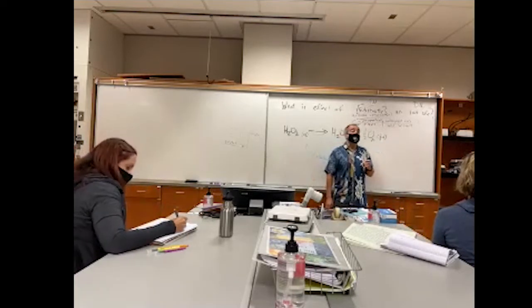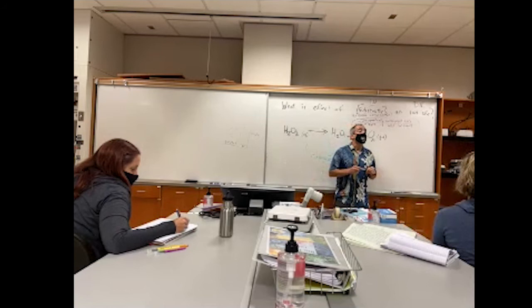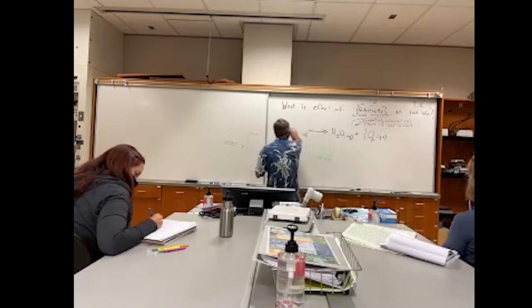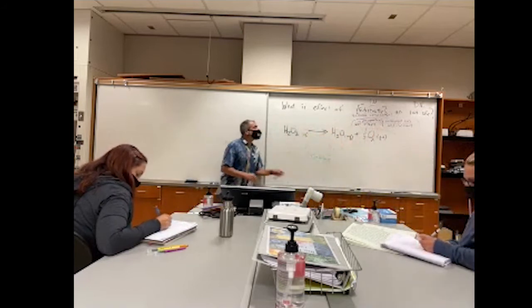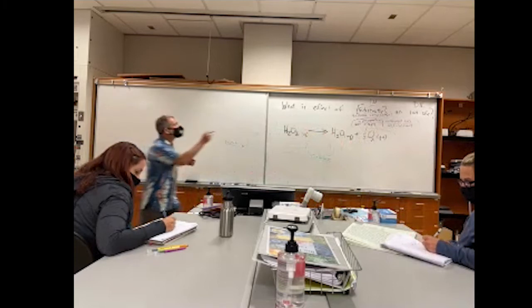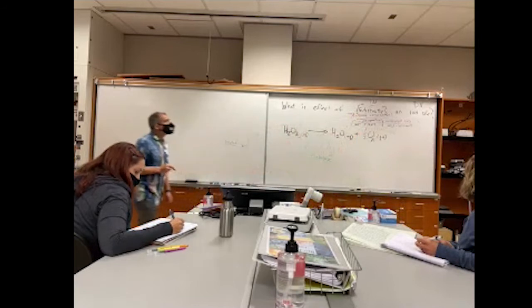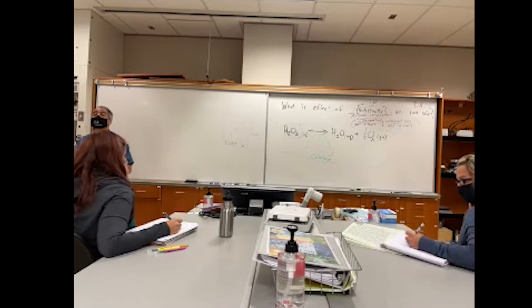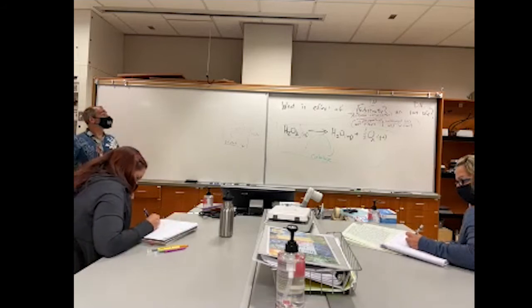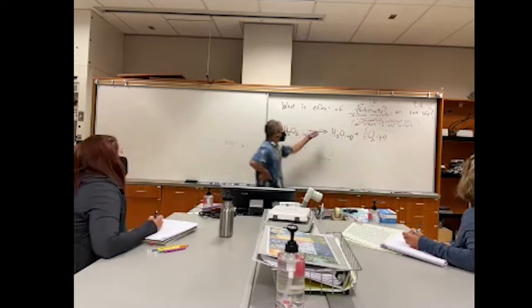H2O2 is very reactive. So this is going to be our reaction we're going to look at. Let's start with the substrate concentration, our independent variable. To change different values of our independent variable, how are we going to do that? Just in a practical way, how can we plug in different substrate concentrations, given that this is just an actual thing?